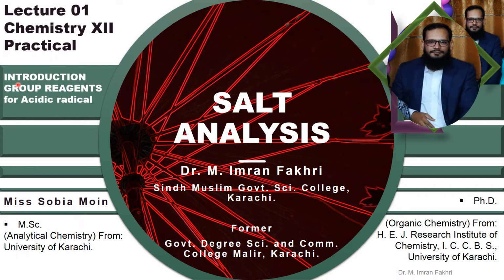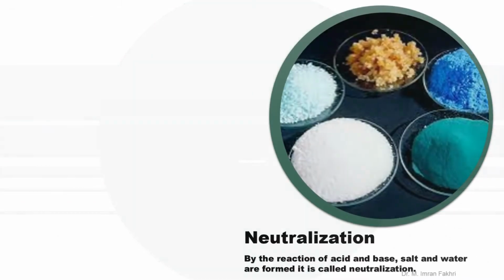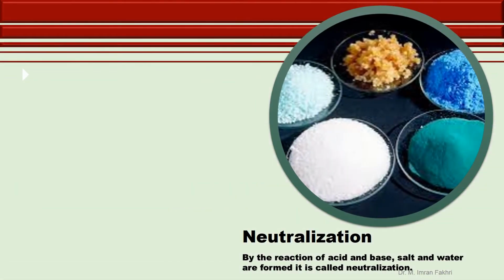In lecture number 1, we are going to discuss the introduction of the group reagents which are being used in the salt analysis. Salts are formed by the reaction between acid and bases.